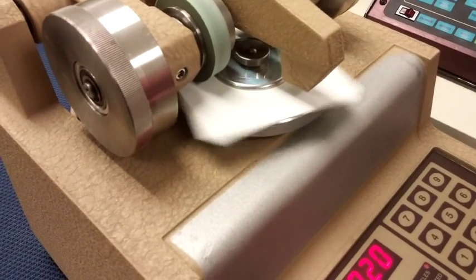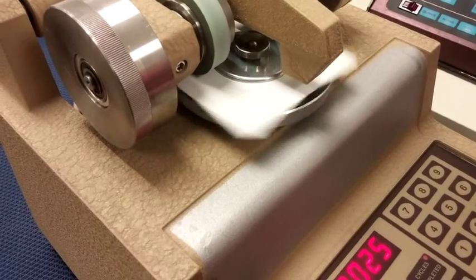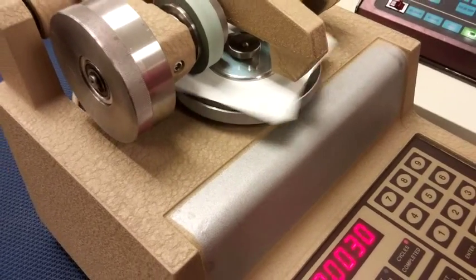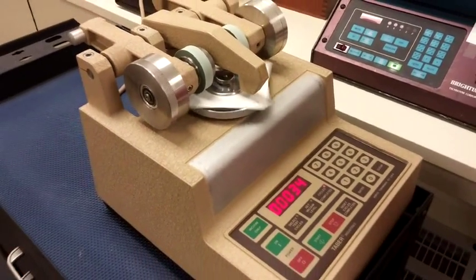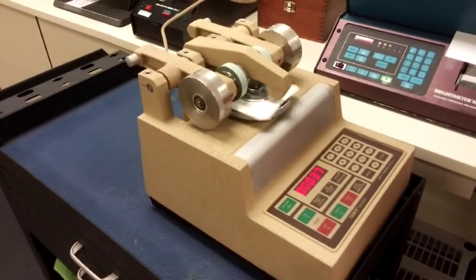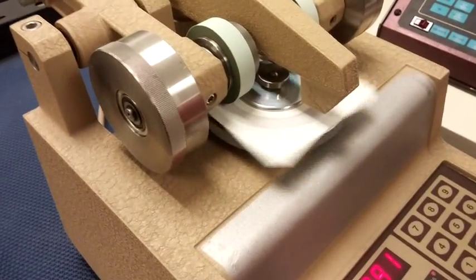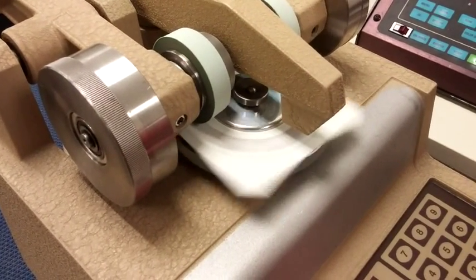The instrument consists of a horizontal turntable with a center clamp, which revolves at 70 to 75 revolutions per minute and holds the test specimen. Two weighted special abrasive embedded rubber wheels rotate freely on the surface of the specimen. The specifics of the abrasion test are given in TAPPI Test Method T476 or ASTM D3884.